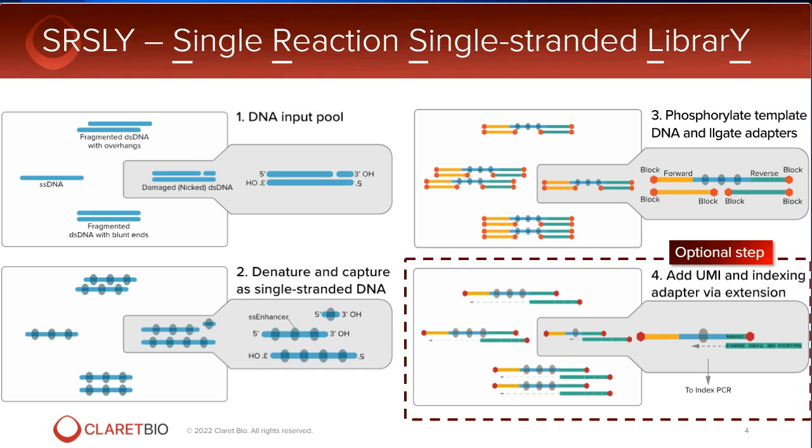And that's what's happening here in step 2. So you see that a duplex molecule becomes two independent single-stranded molecules. One single-stranded molecule stays single-stranded, and a nicked duplex molecule becomes at least 3 molecules, 2 where the nick is and 1 where the strand is complete on the other side. And this can fracture into as many different fragments as needed depending on how nicked or damaged the DNA is.